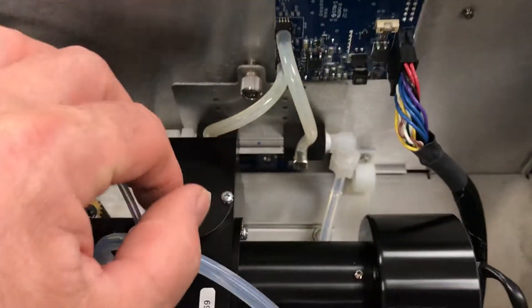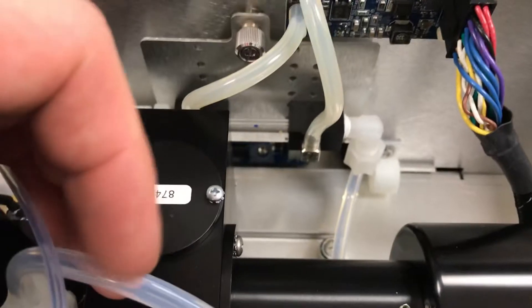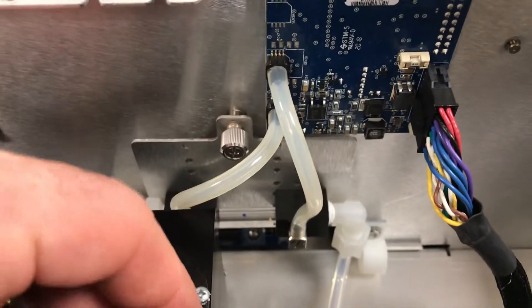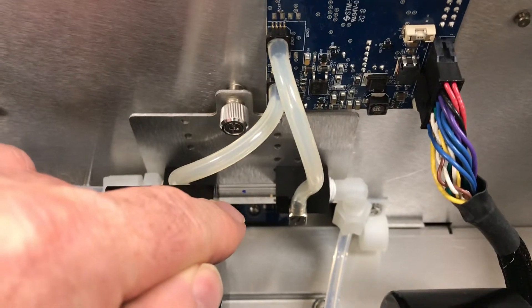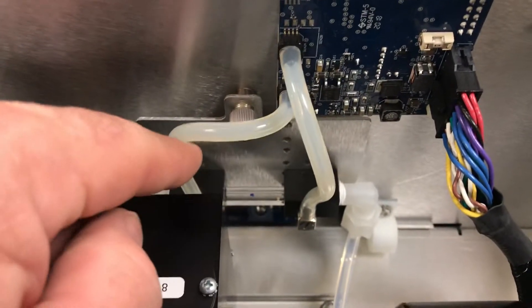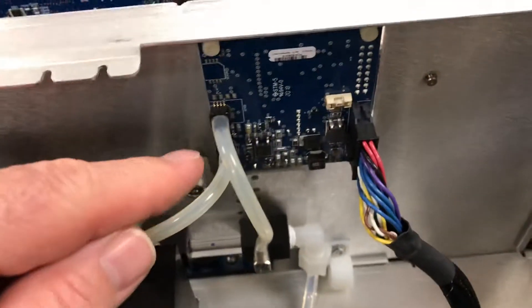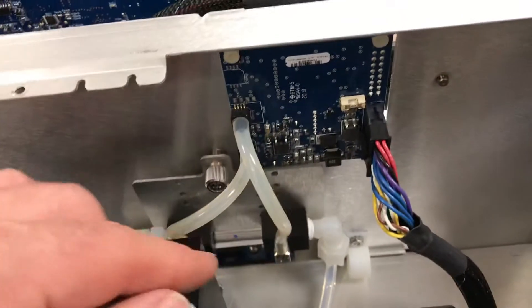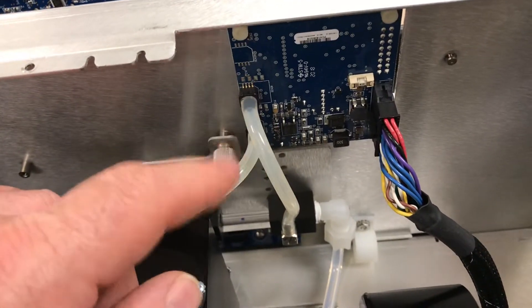One thing I forgot to mention in my last video: the pressure and flow sensors are eliminated in this IQ series. They've improved it with a glass capillary, measuring the pressure across that capillary for both pressure and flow off this circuit board. So two sensors have been done away with and combined into this one module.